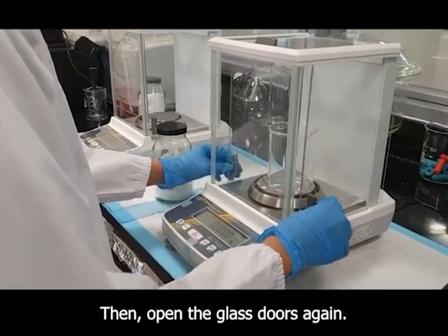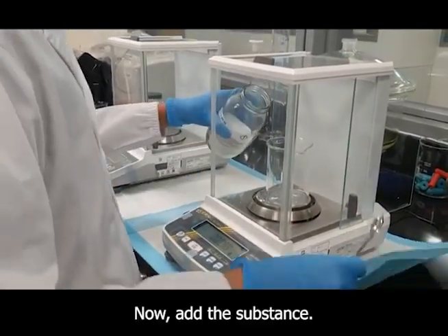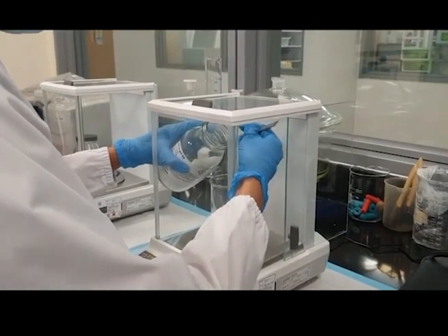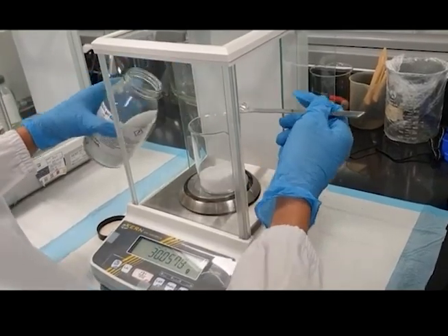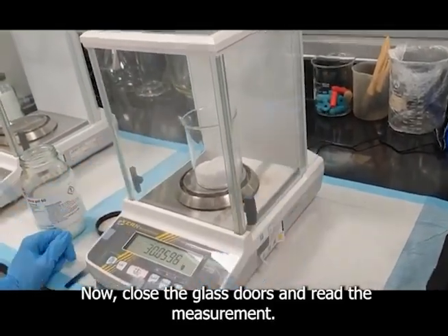Then, open the glass doors again. Now, add the substance. Add it until it is at the required measurement. Now, close the glass doors and read the measurement.